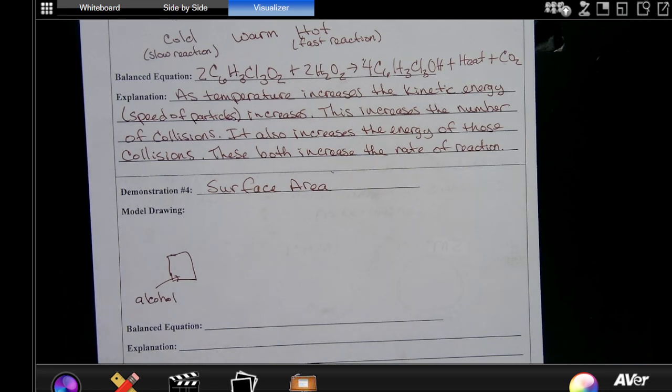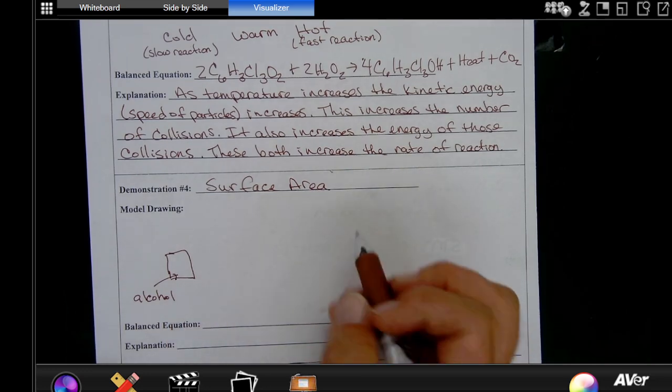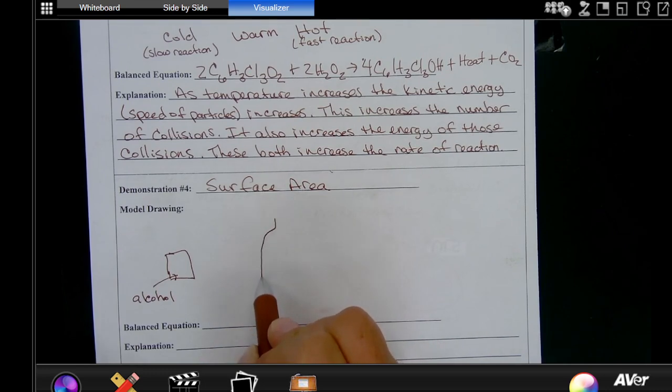It disinfects things. So I'm just going to add some alcohol, and then I'm going to add fire to it. So that's my energy I'm adding to it. And we're going to see what it looks like in a small beaker. Okay. Then we're going to place it into a 5-gallon bottle.